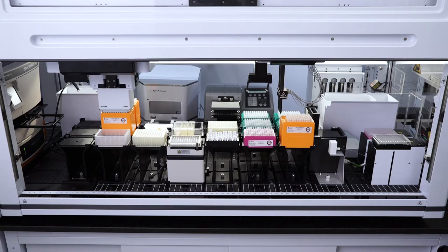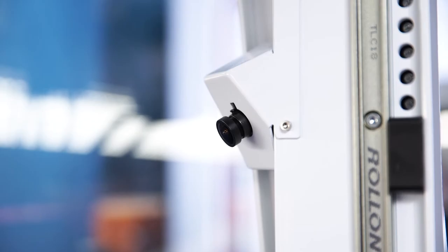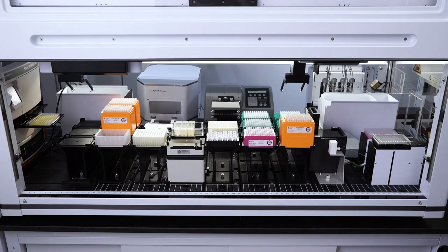Precision pipetting, controlled processing of samples, and the onboard cameras, a unique feature on the Biomech, provide you the peace of mind to walk away from the Biomech.